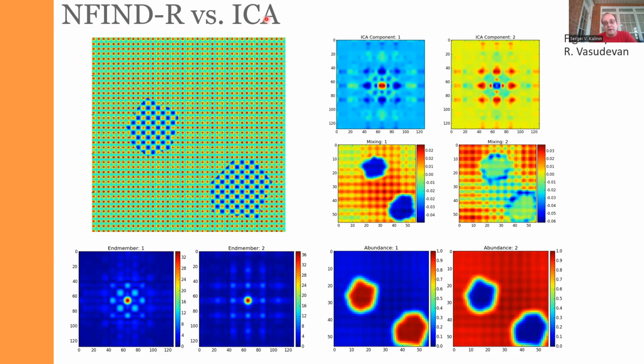It works really well. If the method has a different nature, it will still produce something potentially interesting, but much more difficult to interpret. So the principle that can be formulated is that when you choose your analysis workflow, when you build your pipeline to go from image stack to the loading maps, always experiment, always start with the simpler methods first, and always think about what is your physical foundation for the specific unmixing method, because ultimately it determines how well it works and how interpretable the results are.